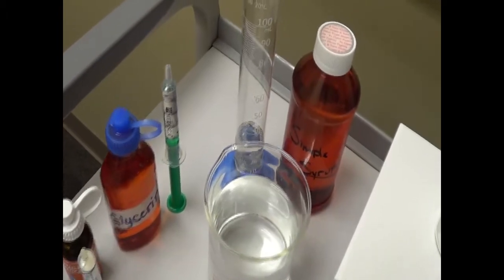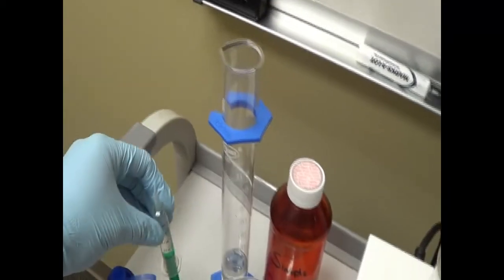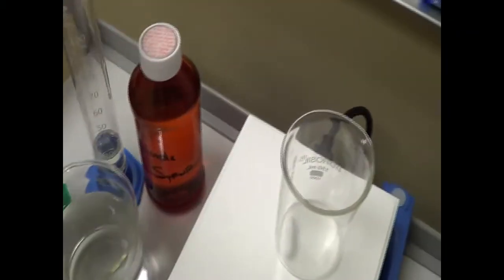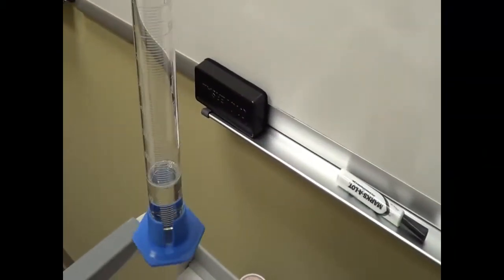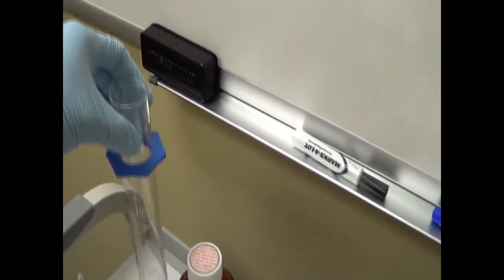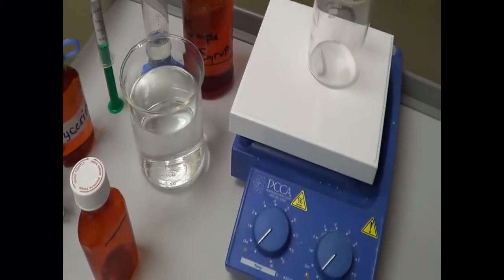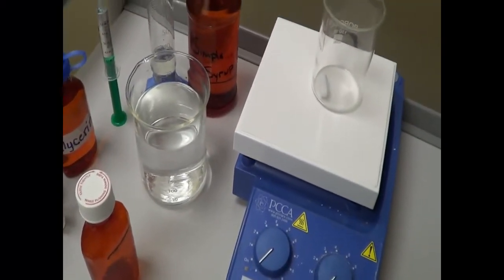I have taken 5 ml of glycerin as you can see — I already measured 5 ml of glycerin. And also simple syrup, where I need 30 ml of simple syrup — I measured 30 ml of simple syrup here. The final solution that we need to prepare is 100 ml.